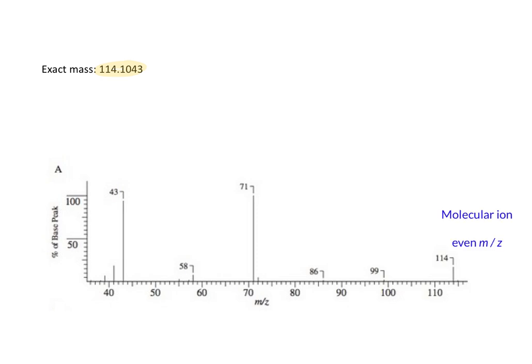That suggests that there are no nitrogen atoms or an even number of nitrogen atoms. The base peak is an odd number, which is consistent with a charged fragment.